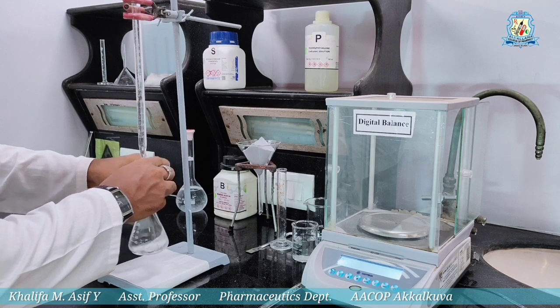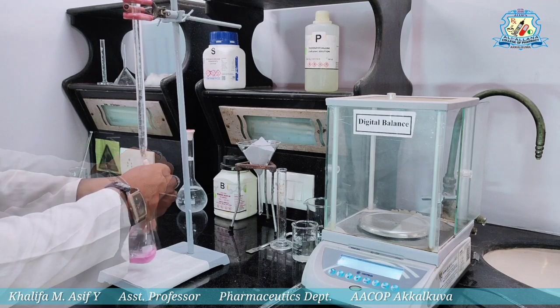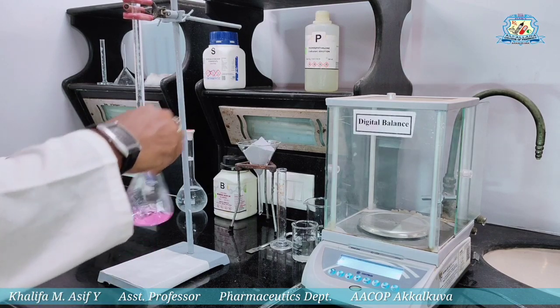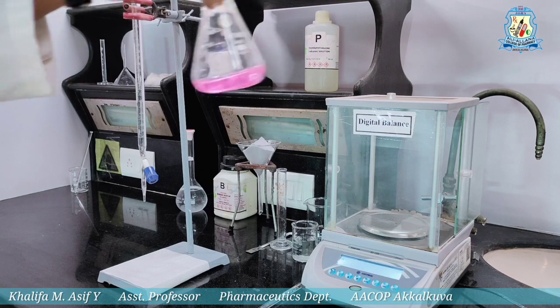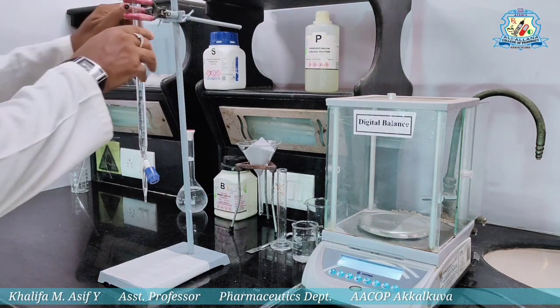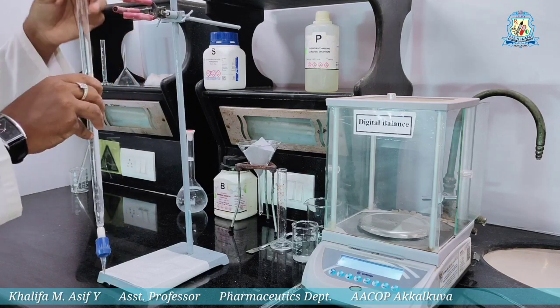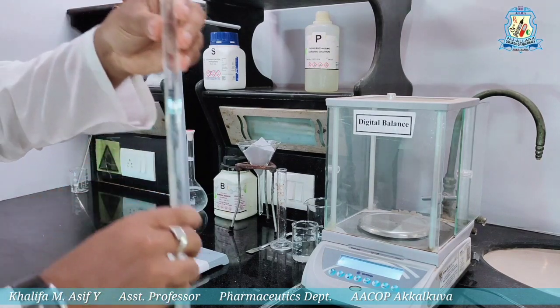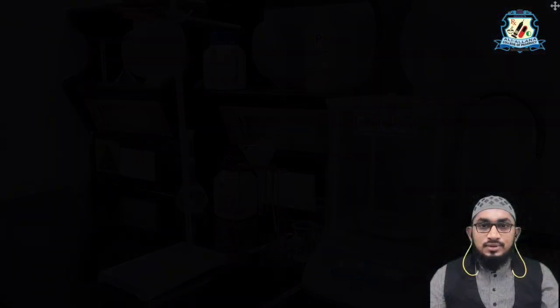Here I have a burette filled with a titrant, that is 0.1 normal sodium hydroxide, and the end point of this titration will be colorless to faint pink. Here my burette reading is 3.2 ml. In this way, we have to take 3 readings and we will use the average of these 3 readings for calculation. So let's see the observation table.